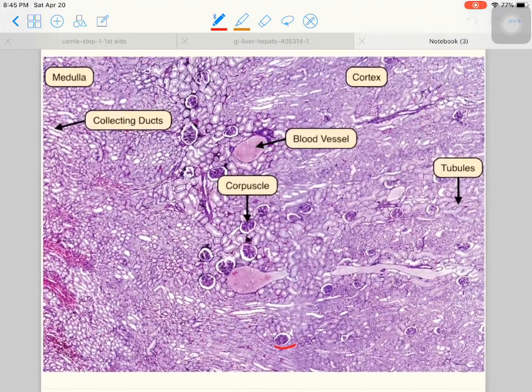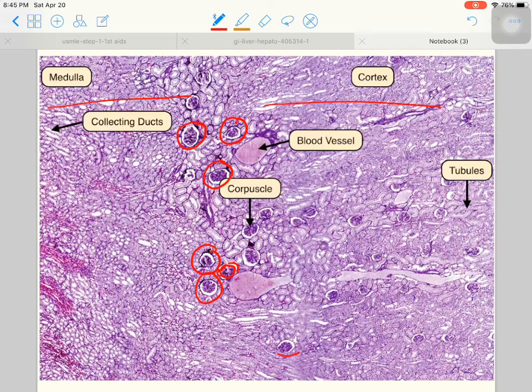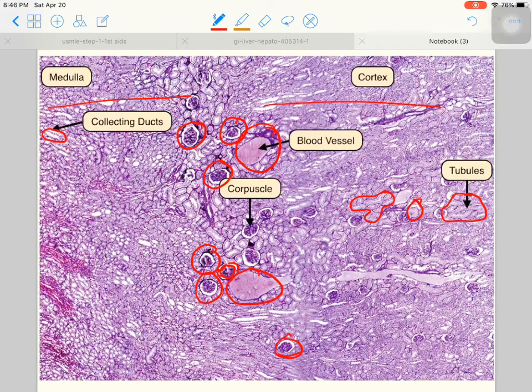If we look microscopically, we can see the cortical region and the medullary region. In the medulla we have mostly collecting ducts and the ascending and descending loop of Henle. In the cortex we have mainly the glomerulus and the tubular system including distal and proximal convoluted tubules. We can see the renal corpuscles within the Bowman's capsule, blood vessels, and the various tubular cross-sections in both cortical and medullary regions.